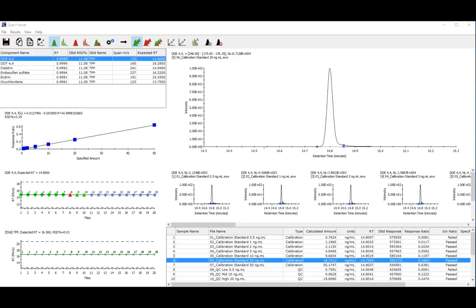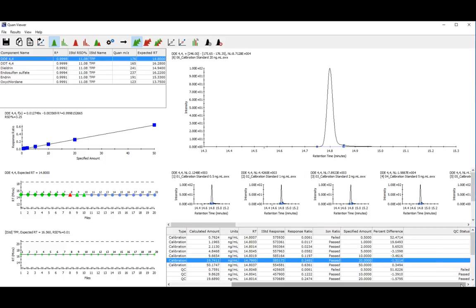You can also review component status in the Quan Viewer table. Here you can quickly see whether your iron ratio confirmation has passed or failed, and similarly, whether your QC samples have passed or failed.